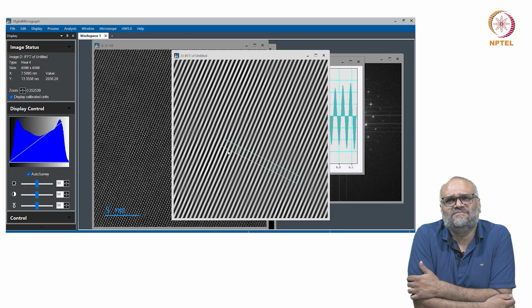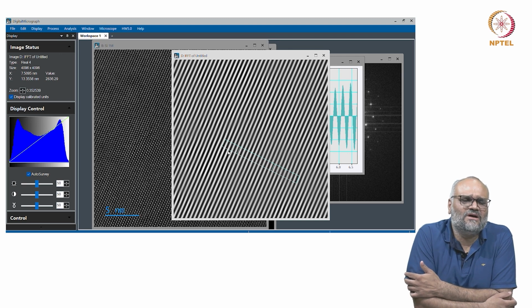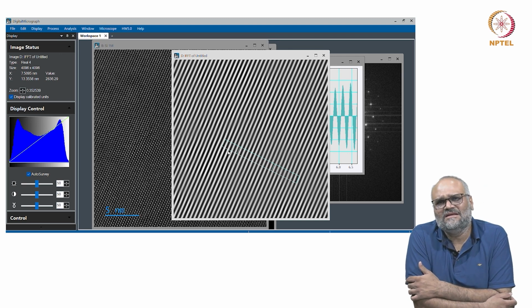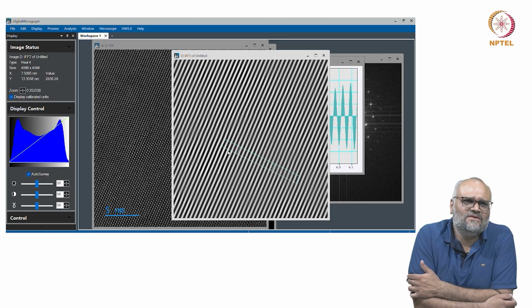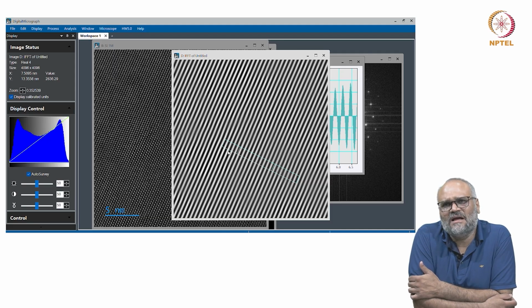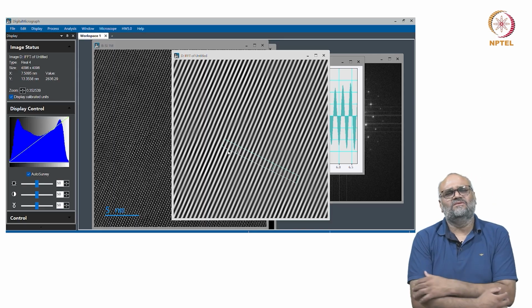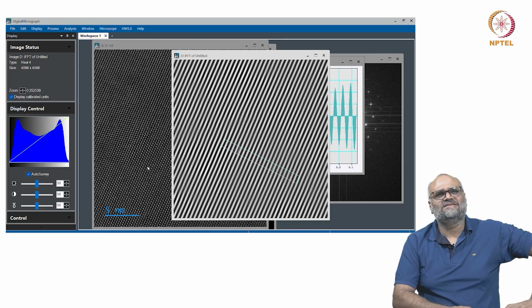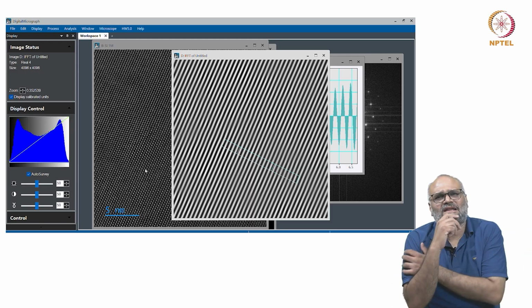the average d-spacing. Now, one of the things that you see is when you're synthesizing a new compound or you have a new phase, the common way in which most of us try to correlate the lattice spacings is to get X-ray diffraction data, get some approximate value of the lattice spacing, and just look around in which of the directions it is matching, and then you somehow try to course correct or fit the data.